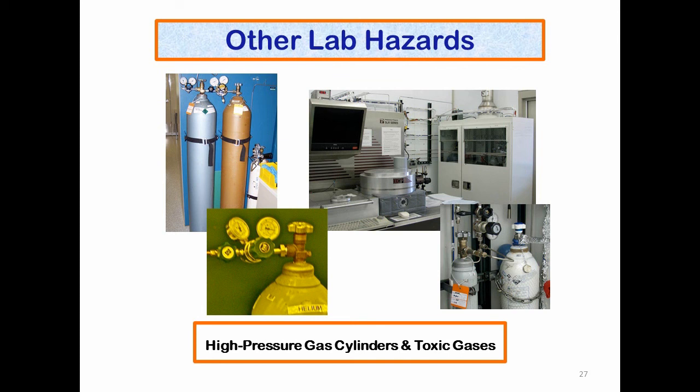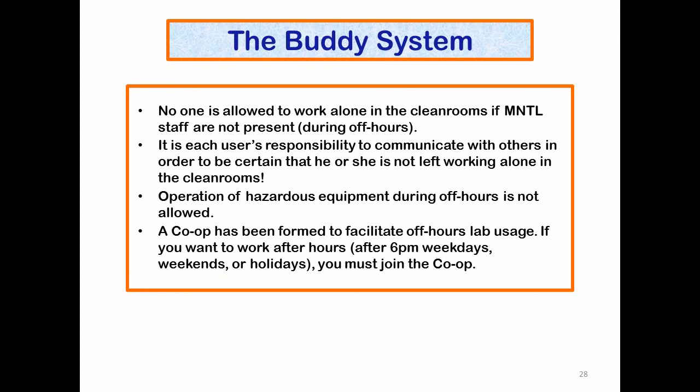We do have high-pressure gas cylinders and toxic gases. Please be aware that these are in the building. And if you see anything unusual with the gas bottles or hear any unusual noises or sounds, please notify the super users immediately.